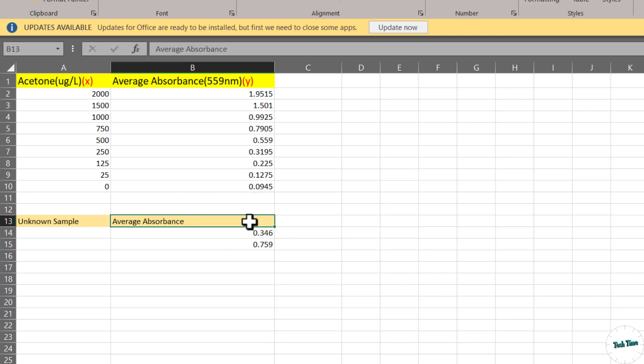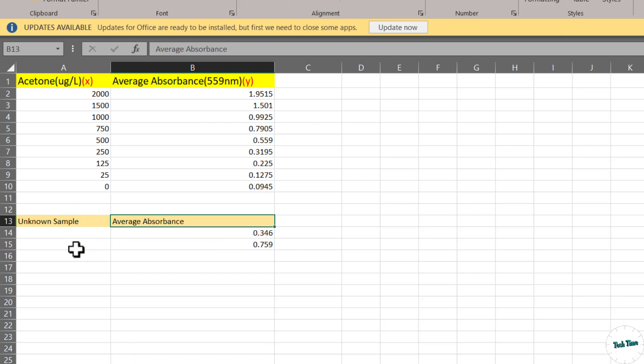Below it you can see we have some absorbance values for two unknown samples. We have to calculate the amount of acetone in microgram per liter in these two samples. So let's get to the video.